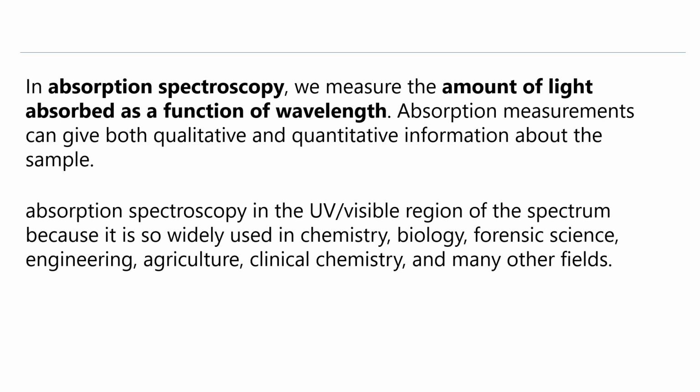Absorption spectroscopy in the UV, that is ultraviolet-visible region of the spectrum, is so widely used in chemistry, biology, forensic science, engineering, agriculture, clinical chemistry, and many other fields.